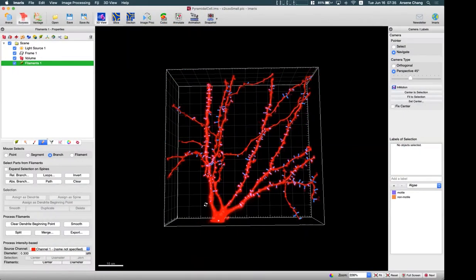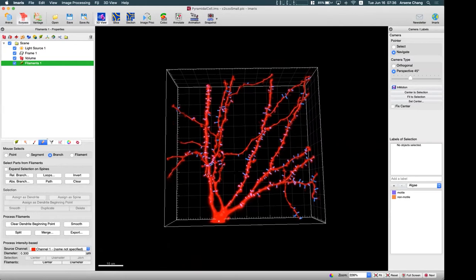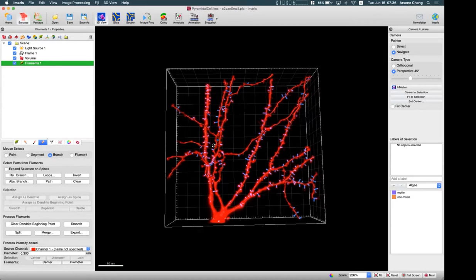We have different processes for whole filaments — for example, you can make the result smoother or you can split or merge different dendrite branches. In general, this is how it works. For auto path tracing, if you don't want to start from automatic detection at the beginning — maybe due to the complexity of the images or it being too large for automatic detection — you can always start from the semi-automatic auto path.